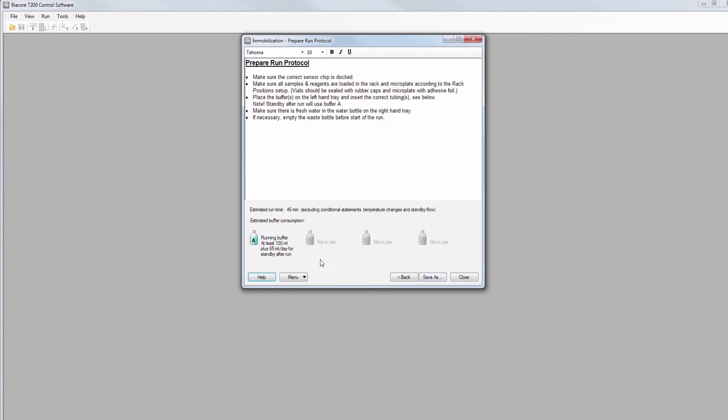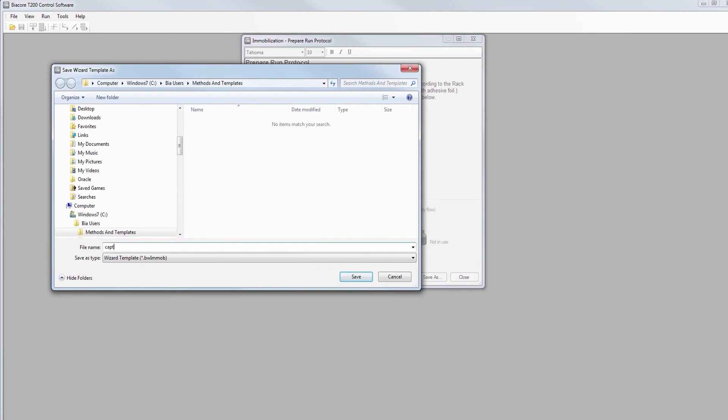Check run protocol before start to ensure reagent volumes and estimated run time. Name your run file and method, and save in an appropriate folder.